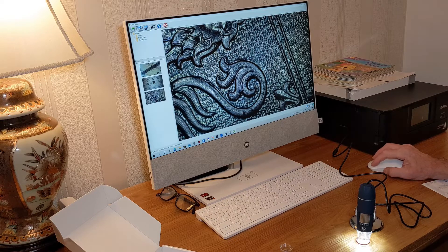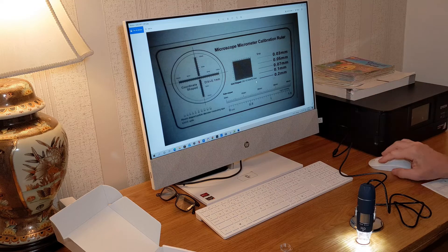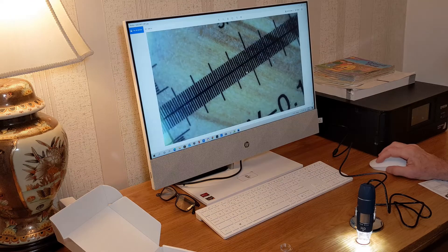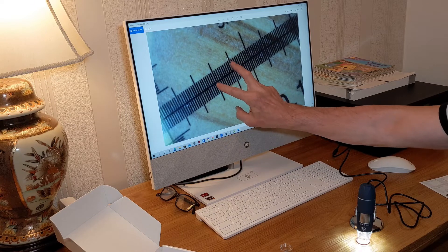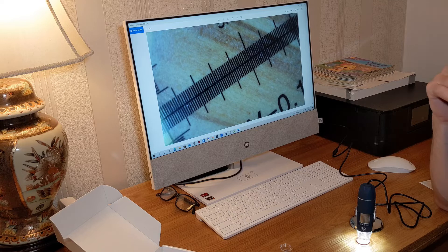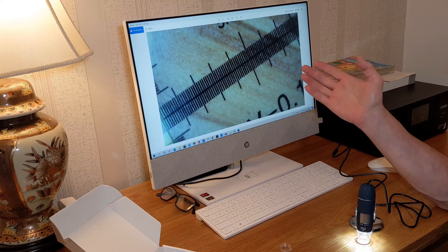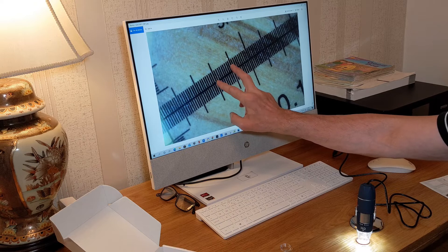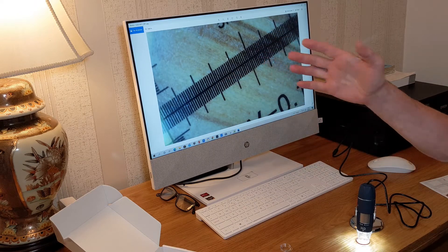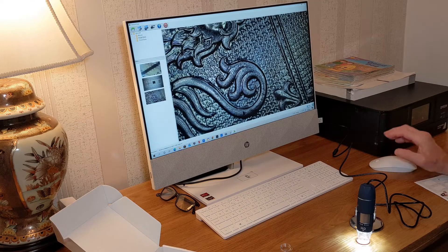Let me show you the microscopic micrometer calibration ruler. It just gives you some measurements on there. I think you just zoom in a bit on it - so between that line and that line is one millimeter. So it does zoom in quite a bit. Whether it's up to a thousand times I don't know - it looks more like a hundred or so. I could be wrong - there's obviously a way to calibrate it online. A millimeter is pretty small, so maybe it is a thousand times. I don't know.